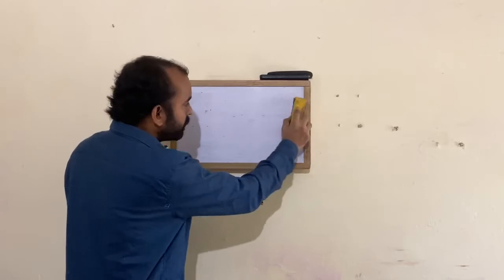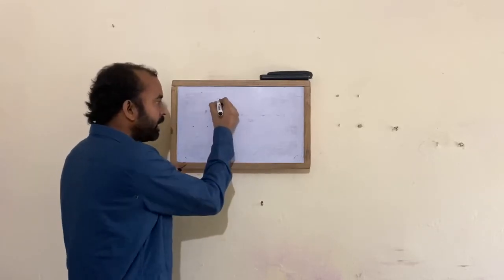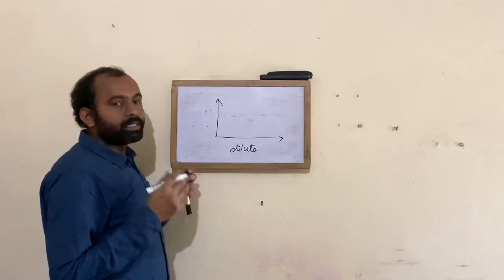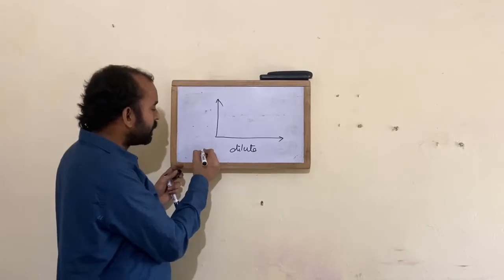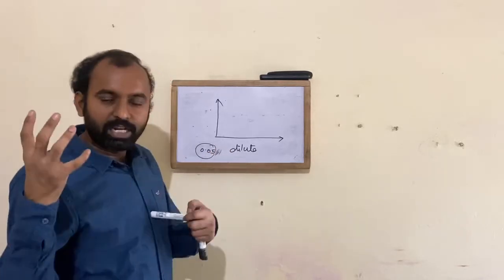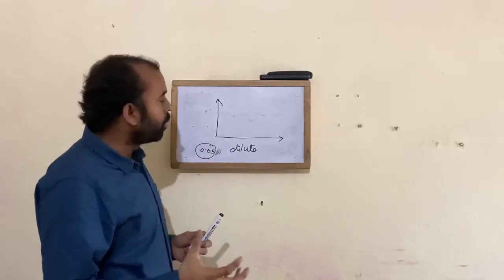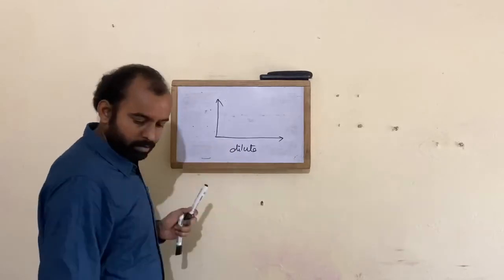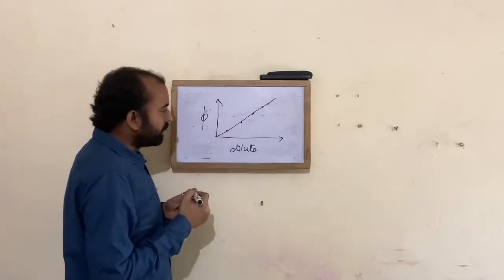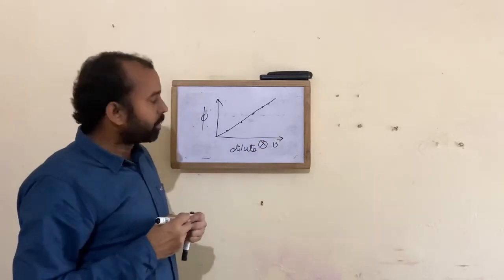Now, when coming to fluorescence, you have a molecule which is highly fluorescent in nature, but the linearity of fluorescence is very well explained in dilute solutions. So what exactly are dilute solutions? They are solutions which are very dilute, whose absorbance is less than 0.05, which is very low in comparison to the UV. Those molecules are very effective in the fluorescence spectrum, where the fluorescence intensity is linear for dilute solutions. So here you can see wavelength or wave number can be taken as a parameter to identify this.